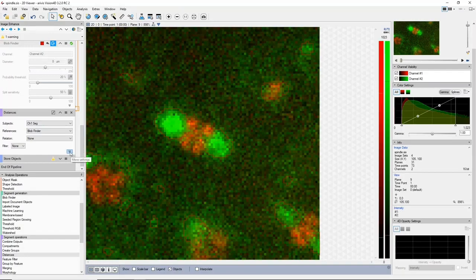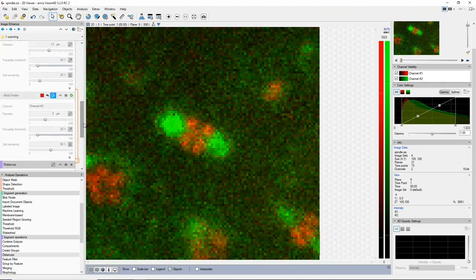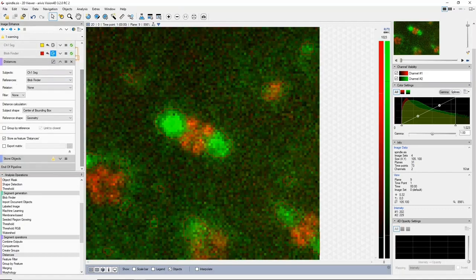But if you expand this dialog, again, we've made it a little bit easier to see when dialogues can be expanded. So let me collapse everything and just expand this one, so you can see a little bit more of the operation in here.